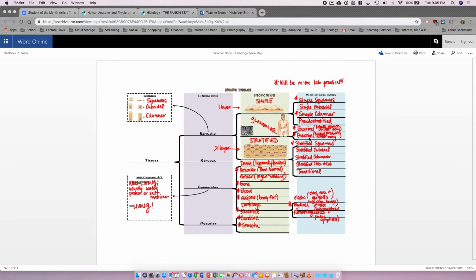We looked at a salivary gland of a mouse, and for the exocrine gland, we looked at a sweat gland on scalp tissue. And then finally, also stratified squamous we covered by looking at the esophagus or skin. So remember, the one nice thing about epithelial tissues is that as long as you can tell if they're simple, one layer, or stratified, more than one layer, and you can identify squamous, cuboidal, and columnar shaped cells, they're actually pretty easy to differentiate from one another.